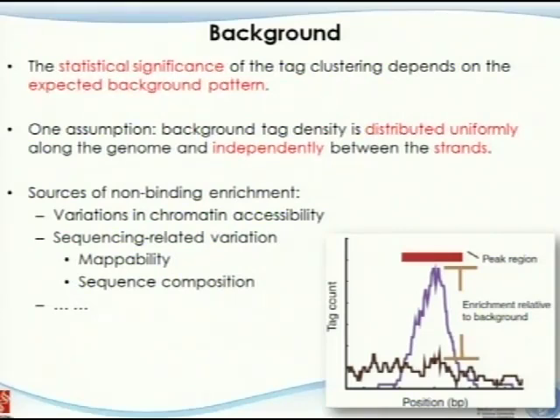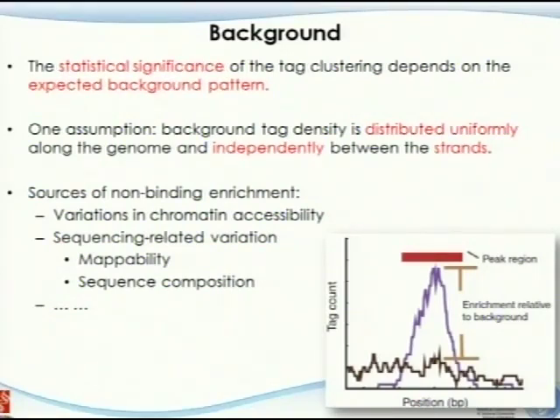There are many different sources of non-binding enrichment. This is not a binding event, but in the input sample — which is non-binding — you can also see this type of enrichment, and that happens a lot in real data. If you look at ChIP-seq data for some no-IP (no immunoprecipitation) control samples, sometimes you also see peaks somewhere in the genome. There are many different ways this can happen.